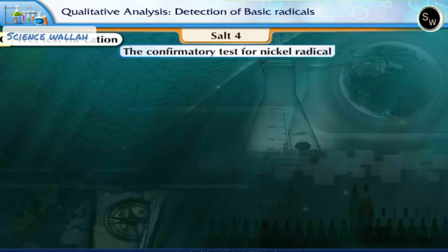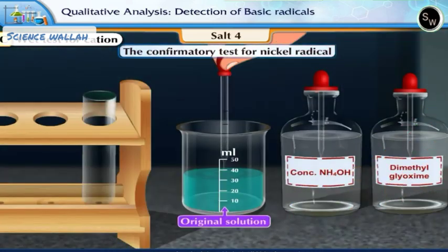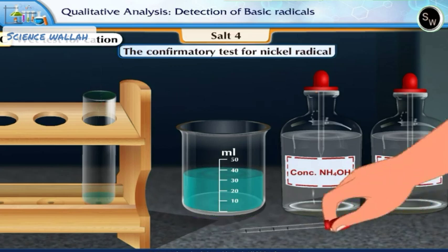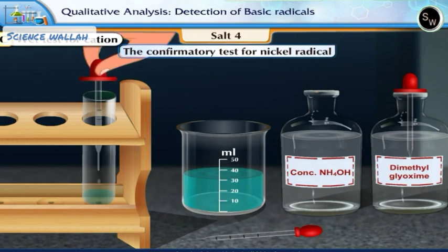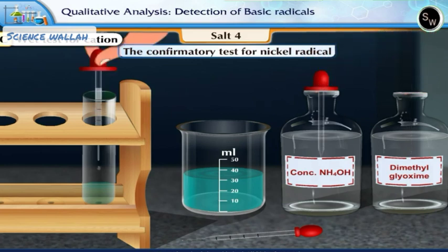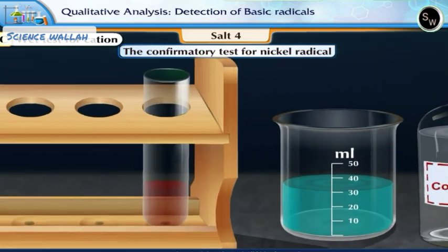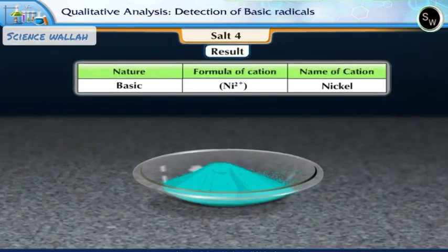Let us now perform the confirmatory test for nickel radical. Take a few drops of the original solution in a test tube. Add a few drops of ammonium hydroxide, then add a few drops of dimethyl glyoxime. We see the formation of a scarlet red precipitate. This confirms the presence of nickel radical. The given salt contains nickel as a basic radical.